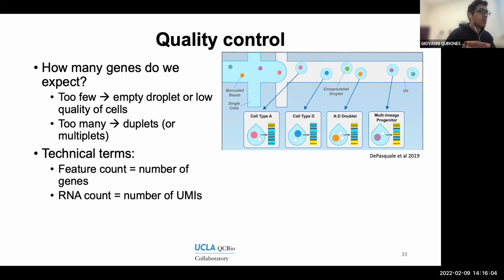And you can imagine that on average, all your cells have around 1,000 genes expressed. So if a particular cell has 10,000, that's clearly too much. It's clearly an outlier. So it will be very dependent on the data set that you're working with. We'll look at the actual numbers when we run the code.